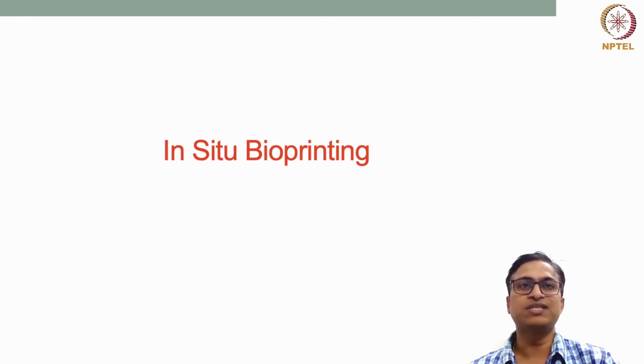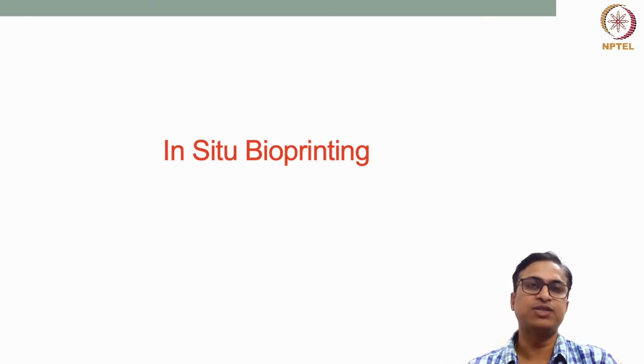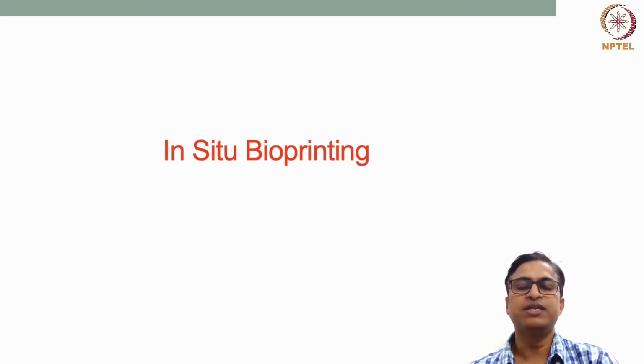So this process involves depositing, as you already have discussed, either inkjet printing or extrusion bioprinting or laser assisted bioprinting to deposit cells plus matrix materials directly on the wound bed, patient's wound bed.